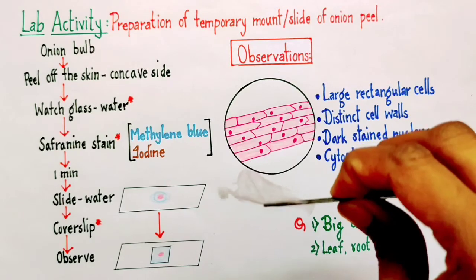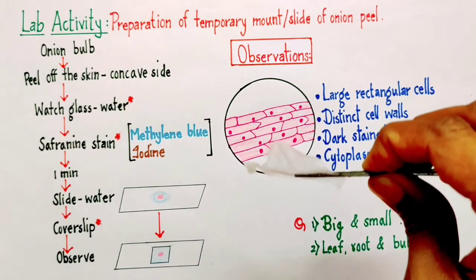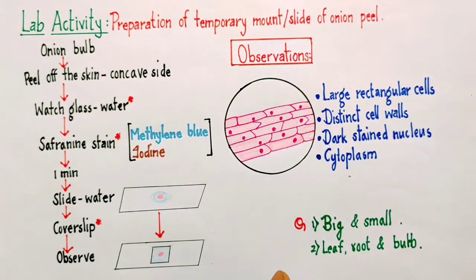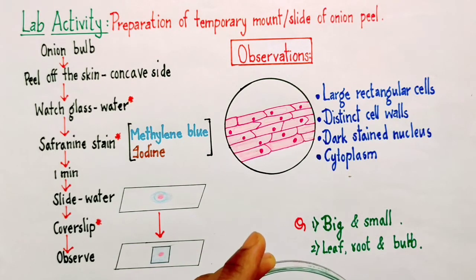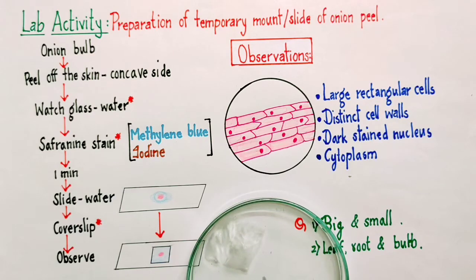And immediately we need to transfer this peel into a watch glass containing water. Now the question arises, why do we need to put this onion peel in water? As we all know that most living cells require water to maintain their good health or to survive.